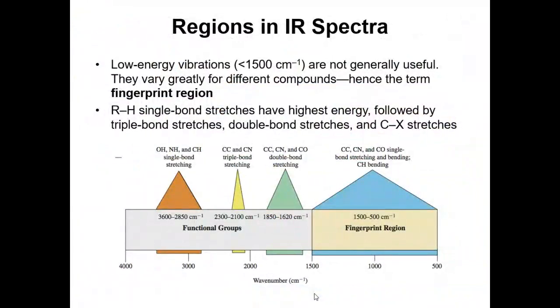If you look at an infrared spectrum, generally you can split it into several regions.